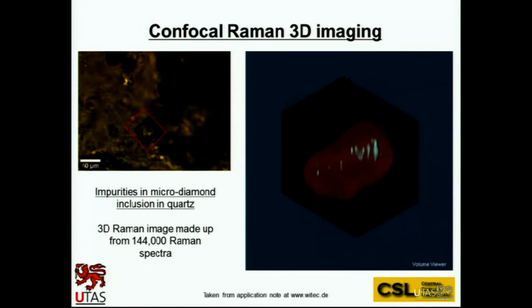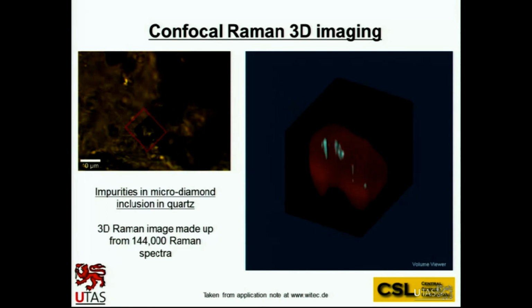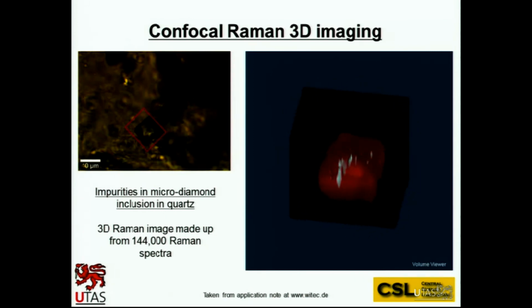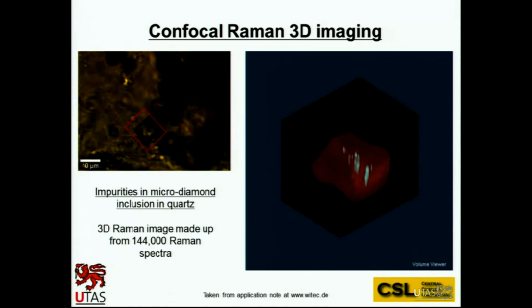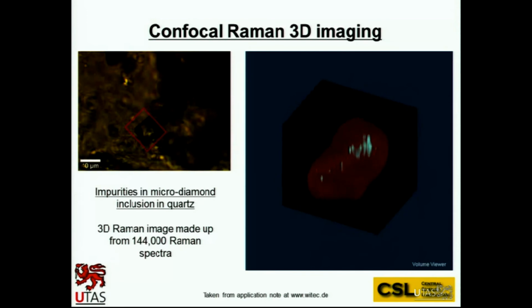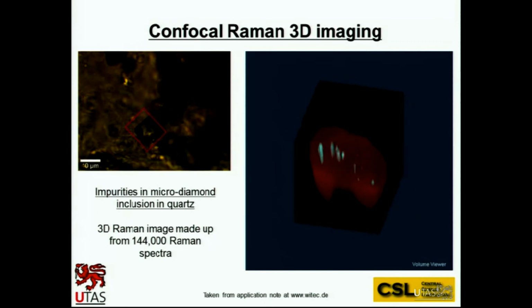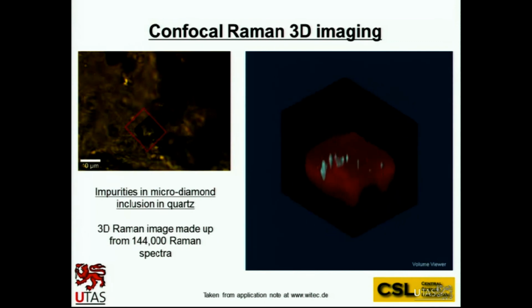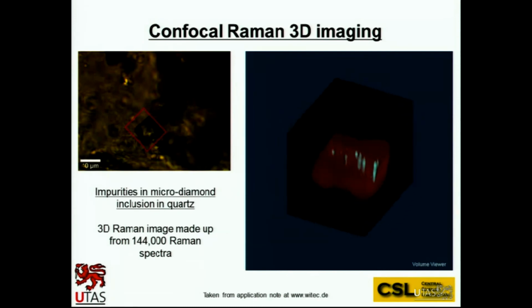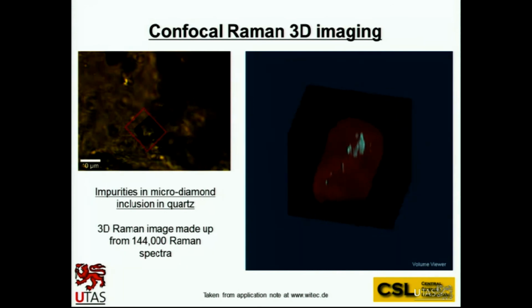I had an example recently from Plant Science. They had some crystal growth in some of the leaves of a succulent plant. Noel had a crack at trying to identify it, but they had to isolate the crystal and it wasn't very easy. With the Raman, it was very easy to do because all you had to do is take that piece of leaf, focus onto the crystal inside the leaf, and take the Raman spectrum. We got a very clean Raman spectrum and could identify it that way. From memory, I think it was a calcium oxalate. That's right, that's what it was.